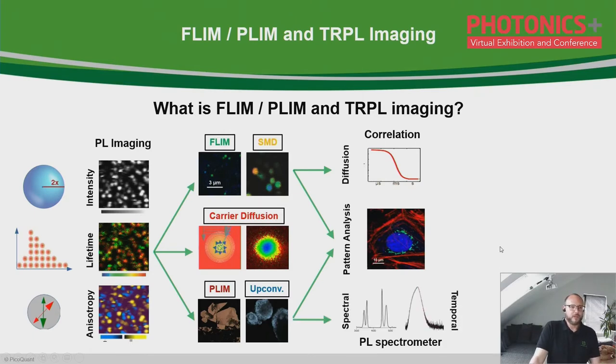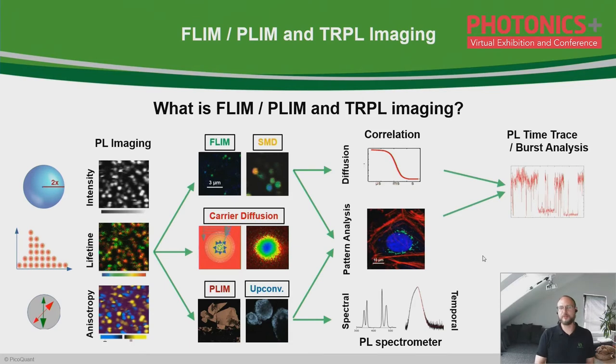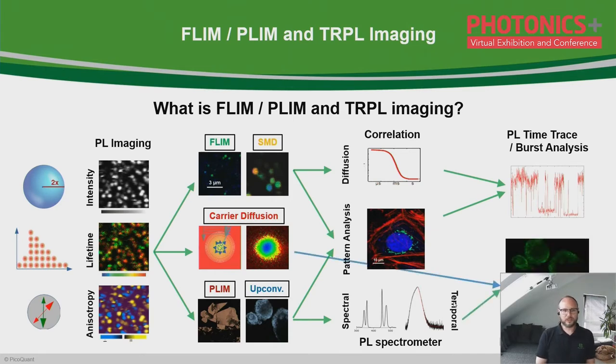Okay, I mentioned before the combination with the spectrometer. So you get, next to the temporal resolution, the spectral information. And of course, the next following step is you can do different types of analysis like a time trace, following the information or a molecule over time. You get an idea about blinking or anti-bunching and power dependencies. This is a really important thing for semiconducting materials or materials which show power dependence properties like for upconversion. And all of these are possible with microscopes.